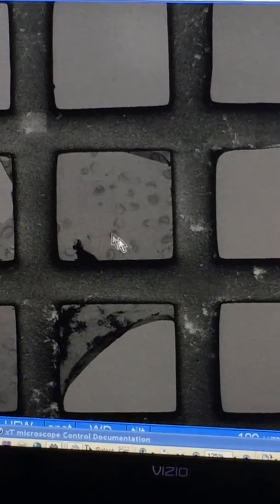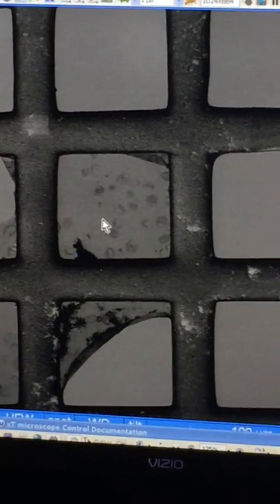Is this the smooth side or rough side of the grid bar? Of the grid? I don't remember. Okay. I should have some of the students in the class look at it next semester. But this one, it looks more like the rough side. Okay.